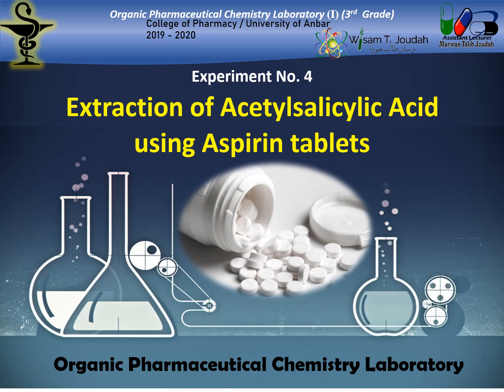تجربتنا لهذا اليوم راح تكون extraction of acetylsalicylic acid using aspirin tablets. يعني راح يصير عملية extraction للأسبرين، لأن نعرف التابلتس of aspirin ما تحتوي فقط الأسبرين اللي هو الأسيتيلساليسيليك acid، لكن تحتوي الفيلينجز وبايندينجز additives، يعني هواي شغلات اللي هي ممكن تكمل أو تساعدنا بالمانيفاكتشرنج للتابلت الاسبرين.